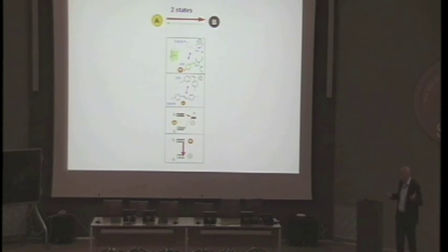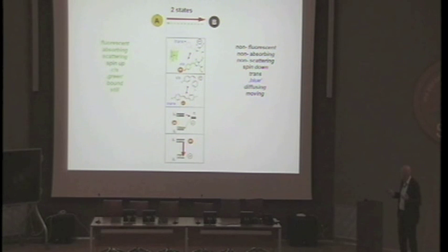And then there can be many sets of states, one can imagine, not just the ones that we have used so far. Maybe you have your own idea to come up with a pair of states that is viable. And of course, the selection of states will determine the details of the performance of the microscope or of the imaging system. And this is, of course, very critical. But it's not necessarily tied to fluorescence. You can even use a bound state and a diffusing state as a kind of state pair.